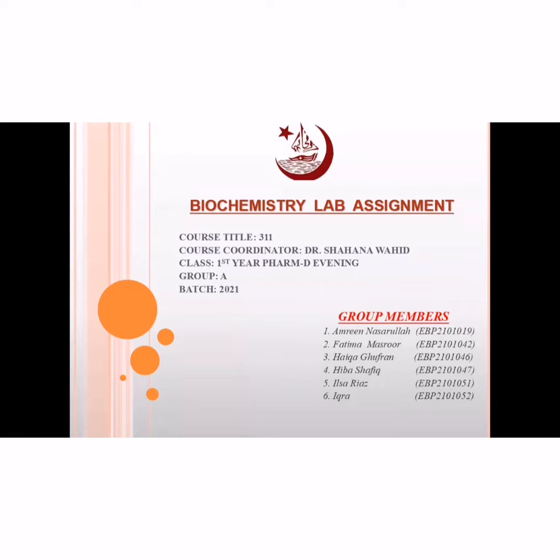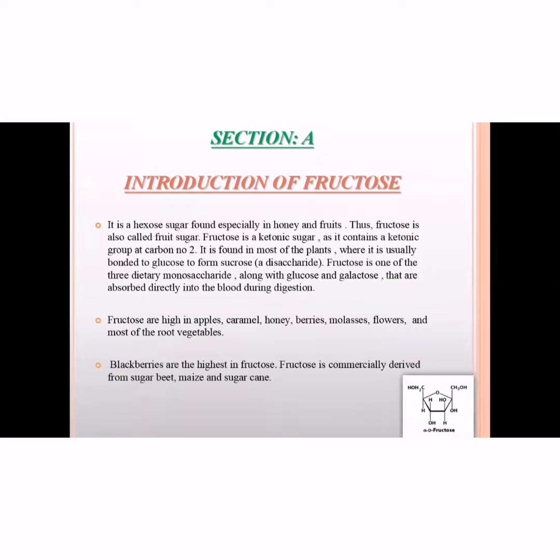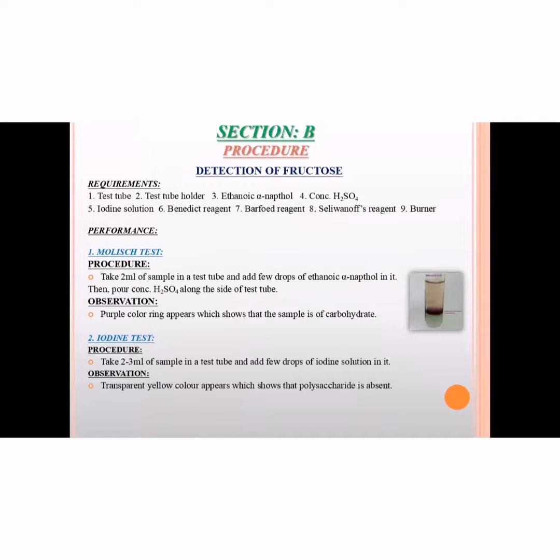Me and my group have prepared a presentation on experiment number 5, fructose and mannose. And the section B, procedure for the detection of fructose and mannose, has been prepared by me. So firstly, I will give you a presentation on the procedure for the detection of fructose.